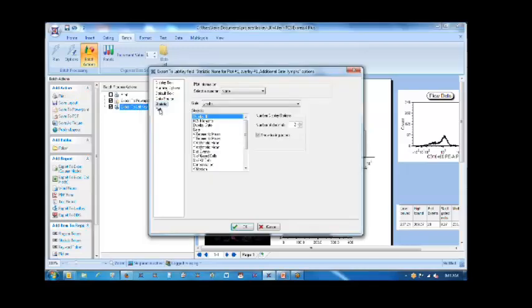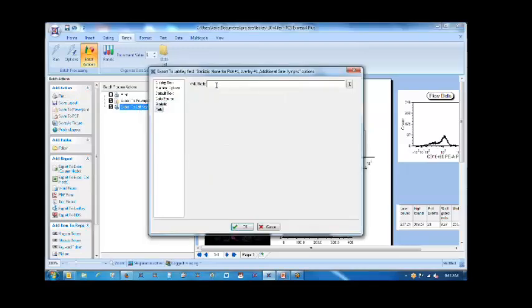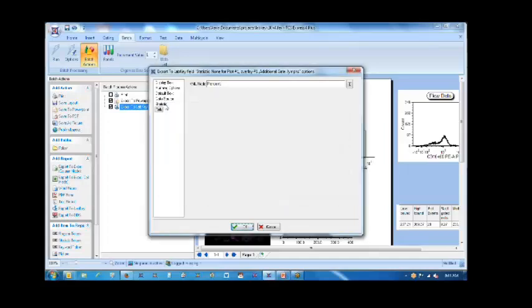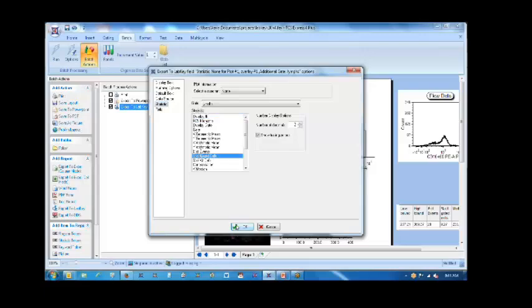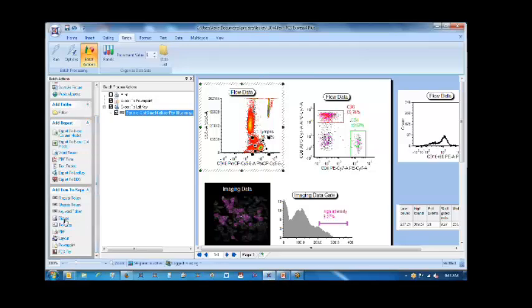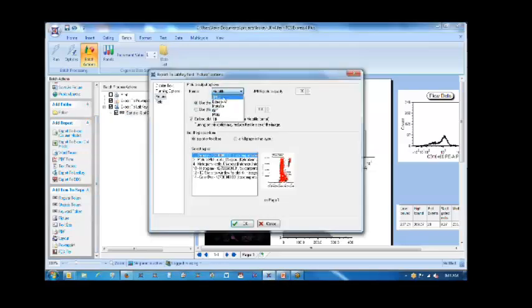We just need to come over here to field and type in the name of the field that we defined in the LabKey assay design. This one was called %. Whoops, forgot to select a statistic that's here. We'll do % of gated cells. We can add in a picture. Let's put in our JPEG, and we'll put in this one.